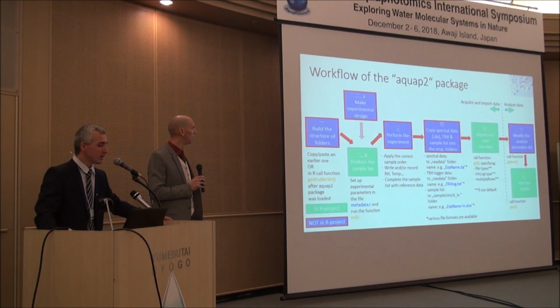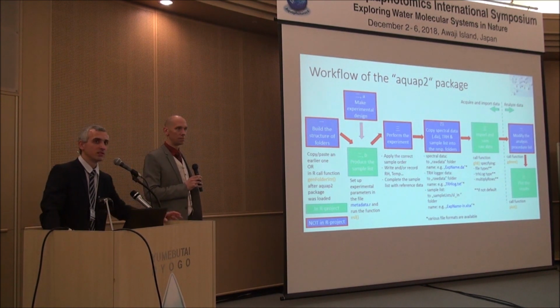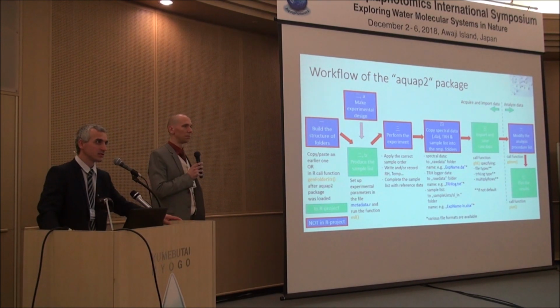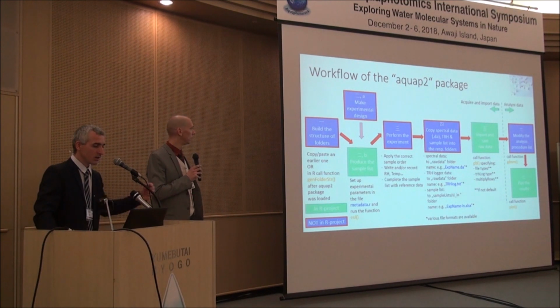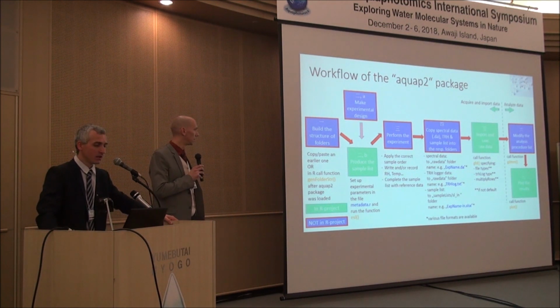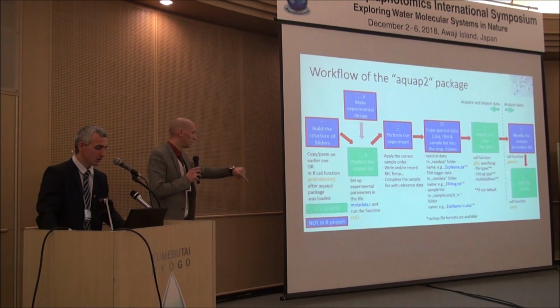Without going into details, first, as Bernhard just mentioned, we need to have a setup. This is what we copied. So you already have this structure for today's demo data. Then it will help you to design an experiment, then it will support the data import, and then you can do the data analysis. These are the steps we would like to go through together with you.